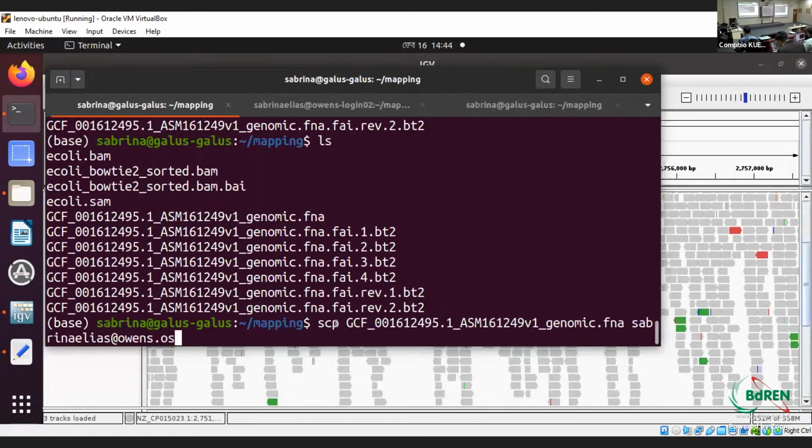So you can just copy this location where you are going to transfer your reference file. So after copying that here, the SCP option will be the SCP, the secure transfer, then the reference file that I'm going to transfer, and then the destination. It will be sc.edu, then the colon, and then I can just copy paste the address I used there.